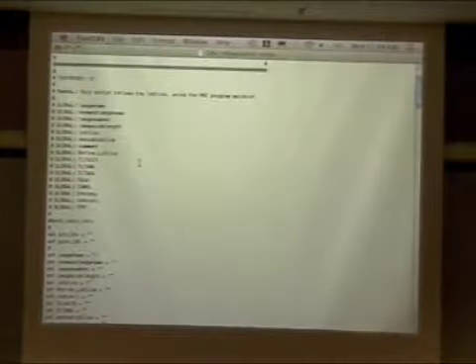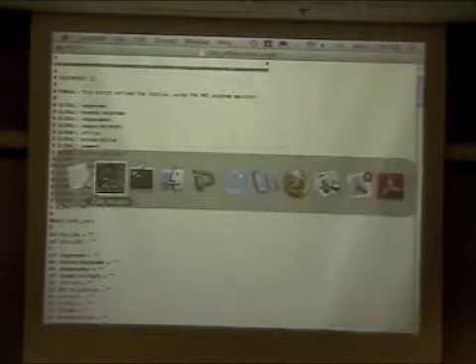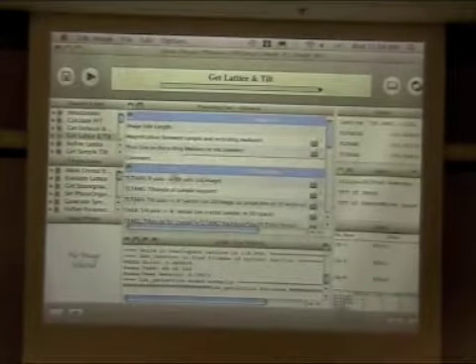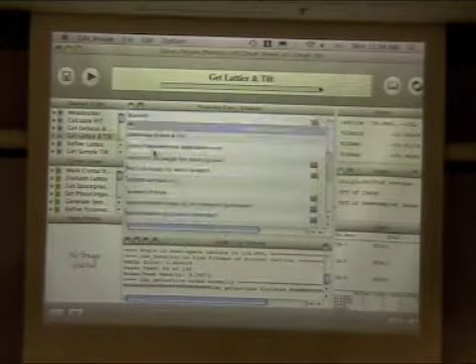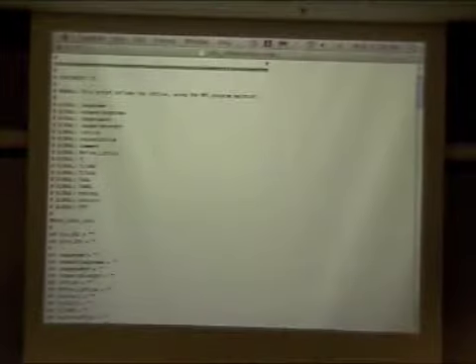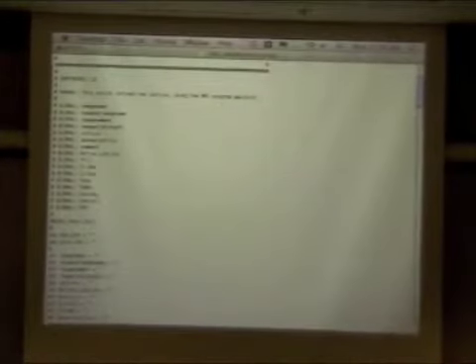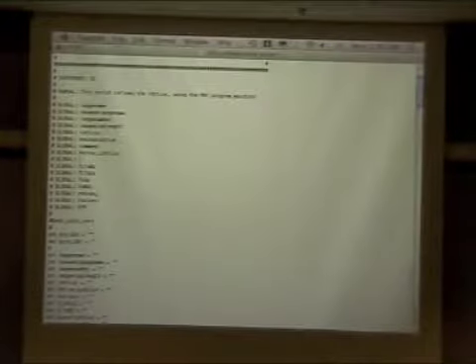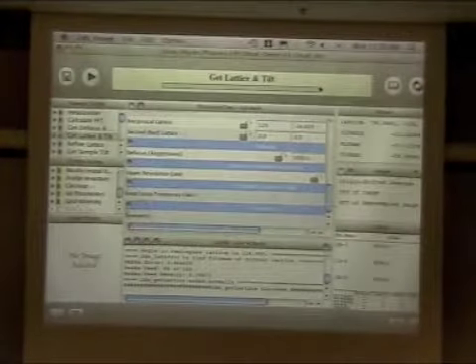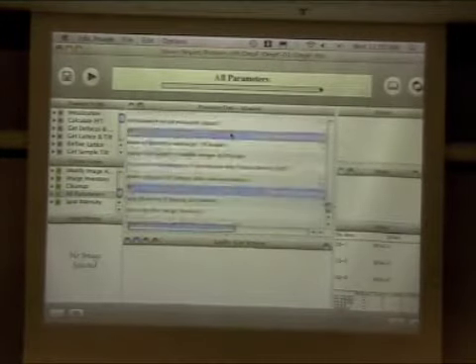Okay, so we've defined our globals. Basically, if you do this global tag and then the variable name, that unique identifier at the bottom, then what will happen is you go into 2DX, and so for instance, let's just pay attention to one of these, tilt axis. You go into 2DX, when it loads up for the first time, you see that tilt axis is in here. In fact, all of these parameters are listed here. You don't have to do it this way. You can actually do what are known as regular expressions. If you wanted to do everything starting with the capital letter P, followed by a letter, followed by a 4 or something like that, it would include all variables of that type. You can also do wildcards, just include everything. We do that, for instance, in our all parameters custom script down here. If you just click on that, every possible parameter is available in this custom scripts area.